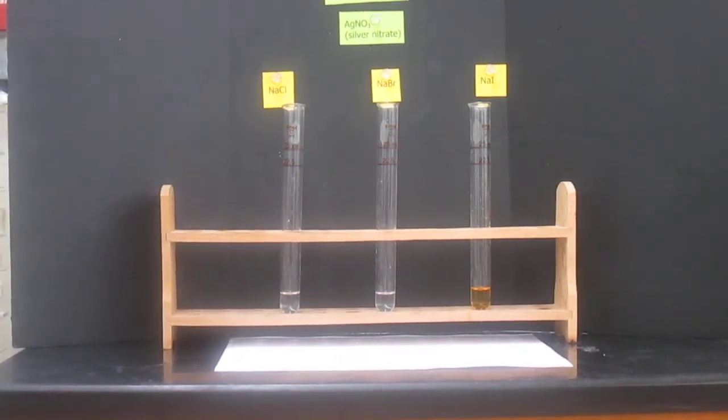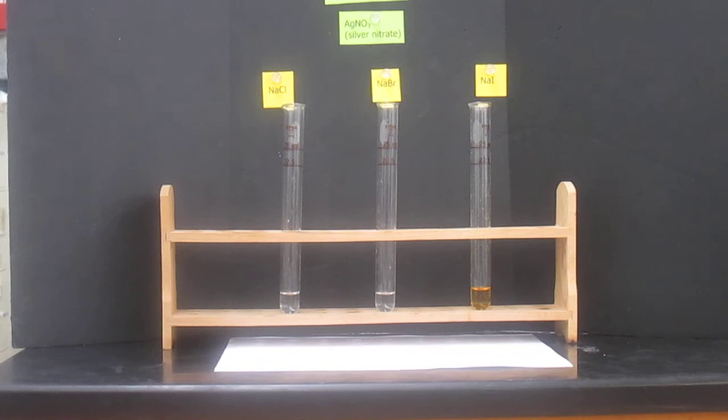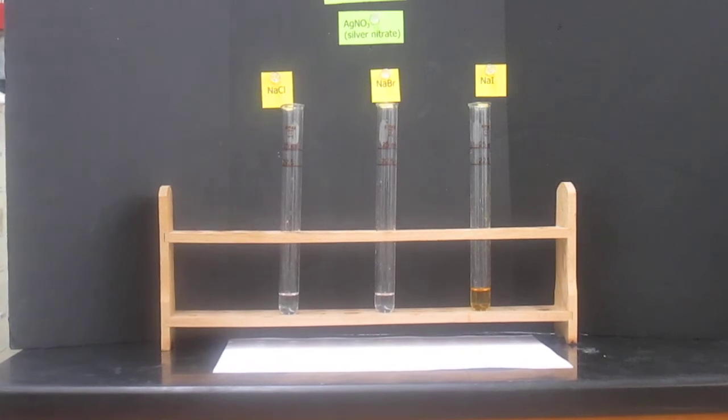Lastly, we are on part 5, the solubility of silver salts. In test tube number 1, we have sodium chloride. In number 2, we have sodium bromide. And in test tube number 3, we have sodium iodide. I will add silver nitrate to each one and then shake them.